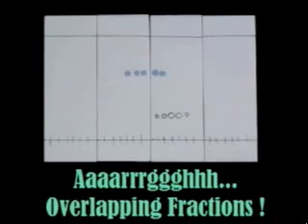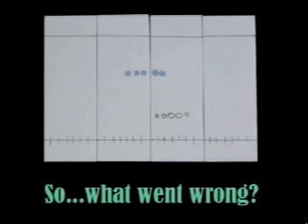Unfortunately, it doesn't always work out so well. Overlapping fractions containing more than one compound are the sign of a failed separation. So what went wrong?